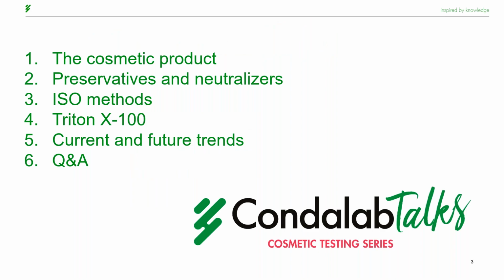So we'll start with a quick overview on the cosmetic product and microbiological risks involved, followed by the importance of the preservatives and neutralizers in the analysis of these samples. We will continue with a general view of an analysis according to ISO regulations. Then we will get to the topic of the Triton X 100 and its prohibition, and finally a small perspective of current and future trends of the cosmetic industry, and to end, of course, the Q&A session.